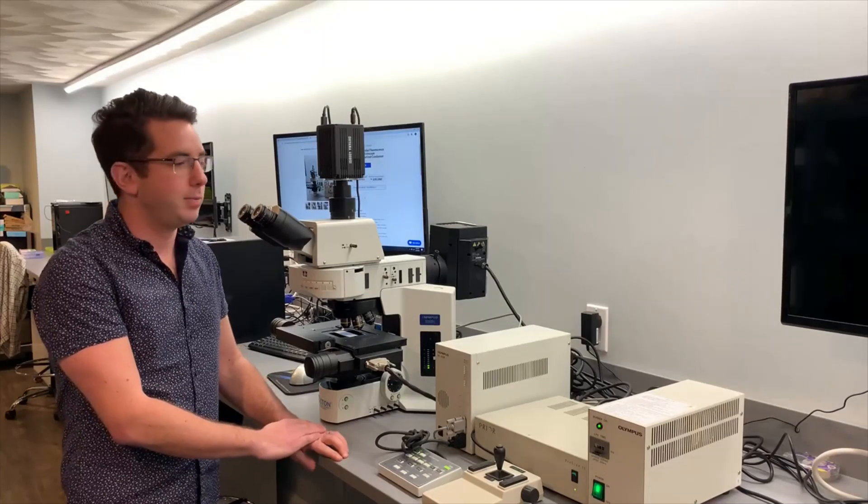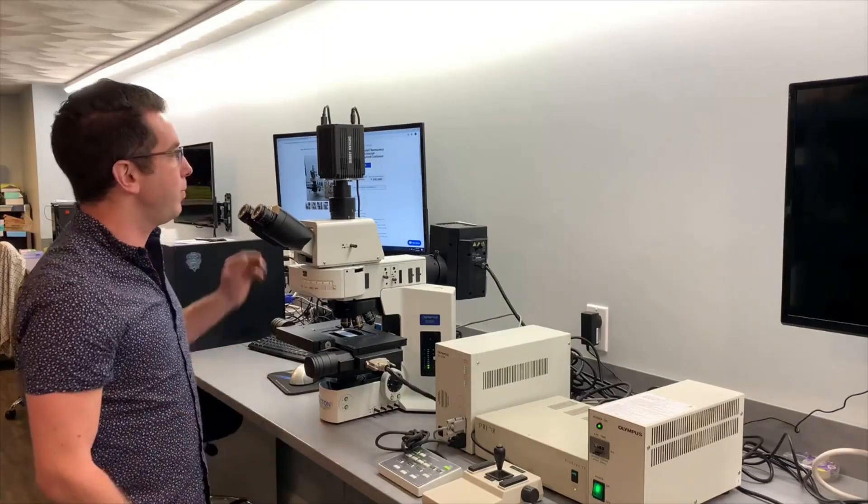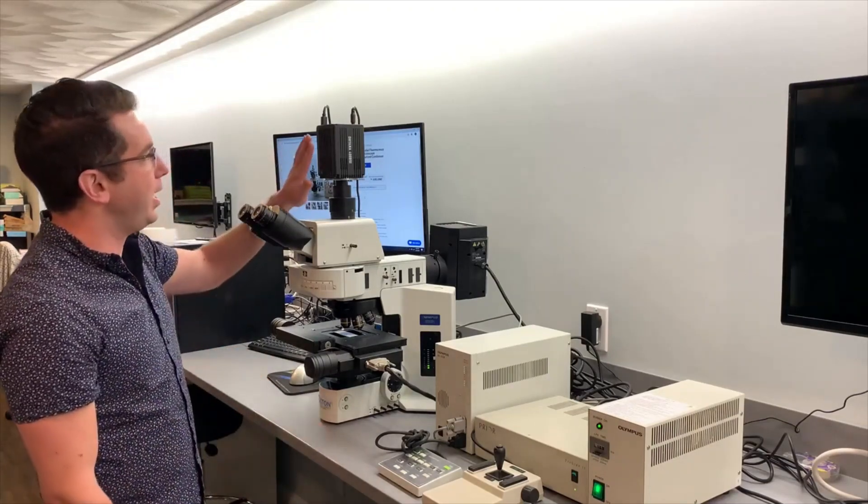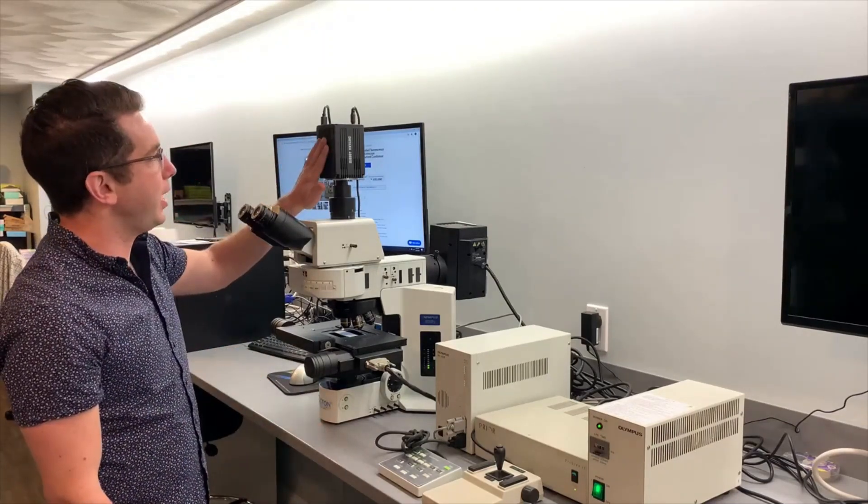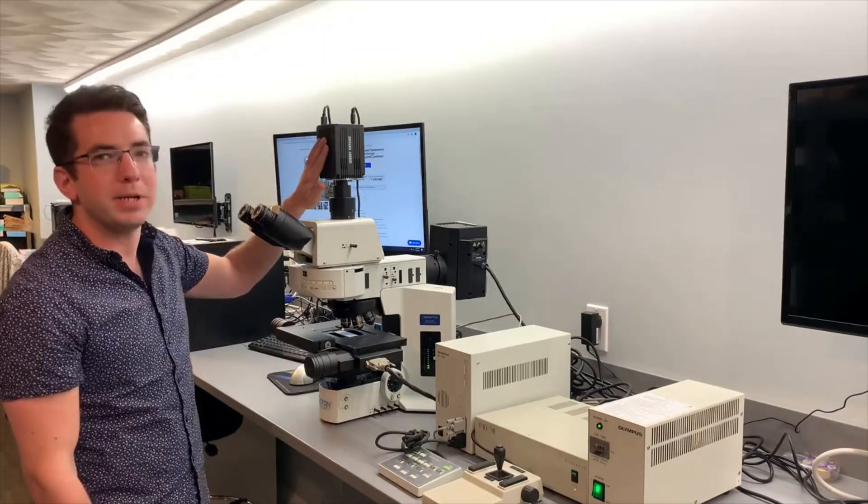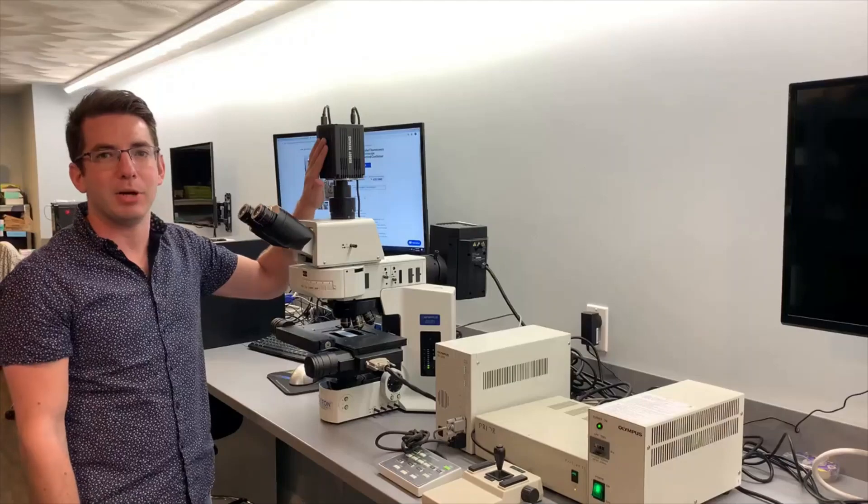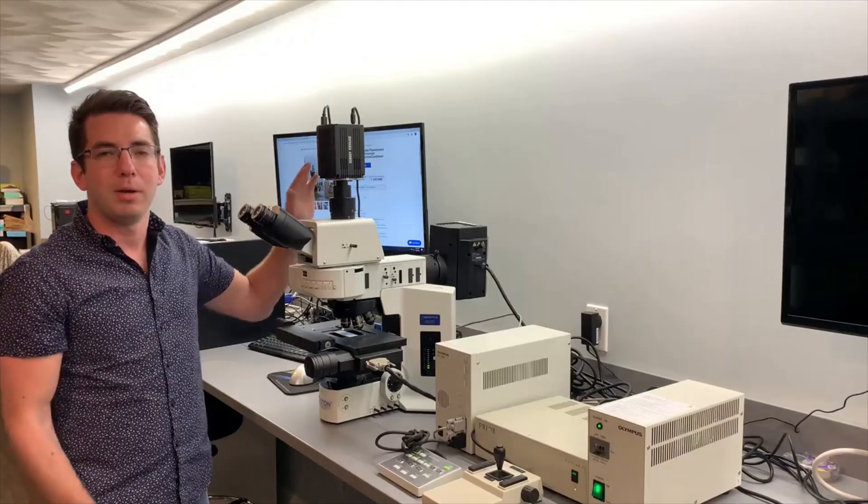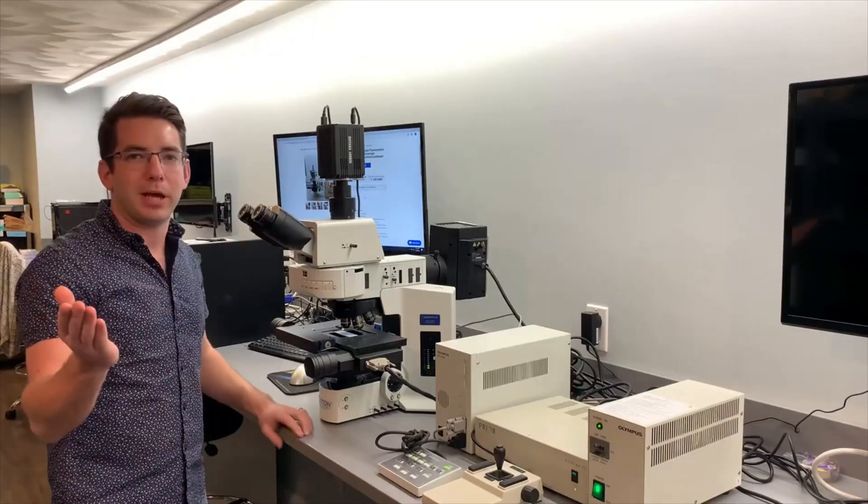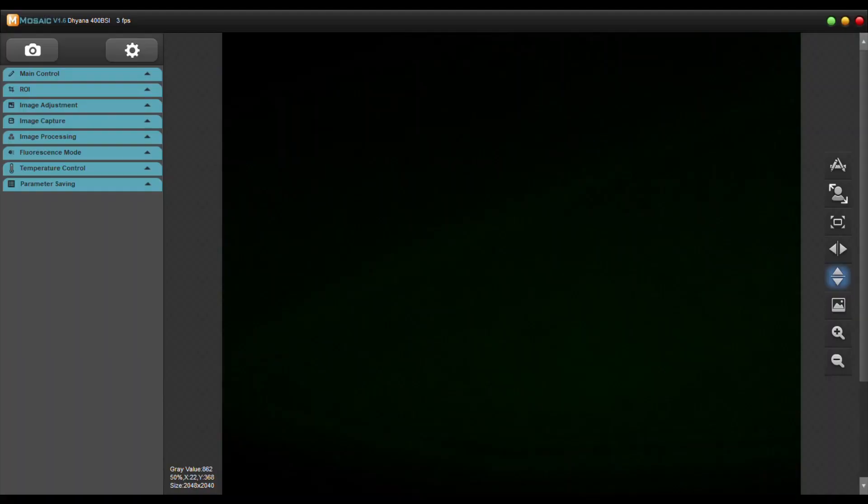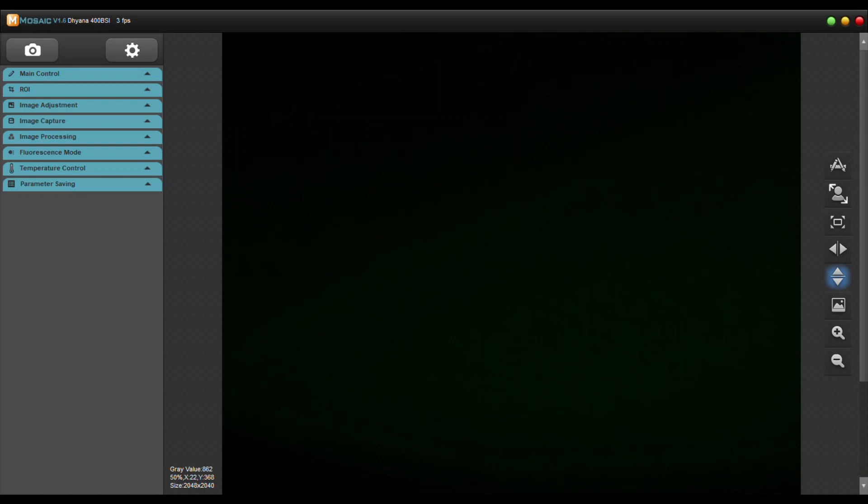On this particular microscope we have a Tucsen DIANA 400 BSI sCMOS camera. Pat's going to explain that a little bit more. Hello everyone this is Patrick from Boston Microscopes. Today we're going to be going over the DIANA 400 BSI camera from Tucsen and we're going to be using their software which is called Mosaic.